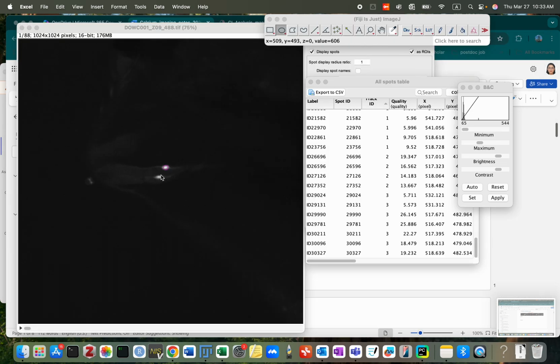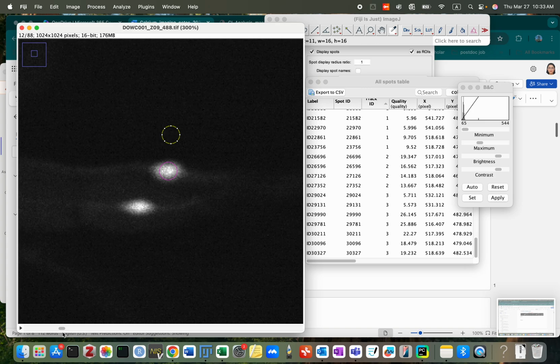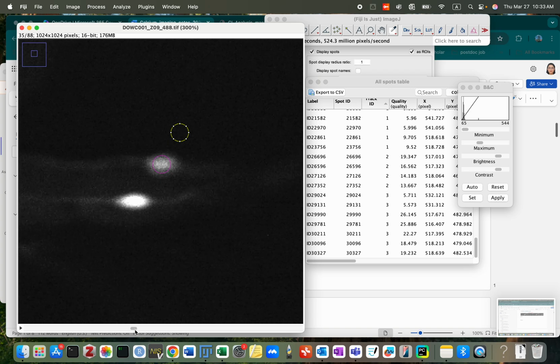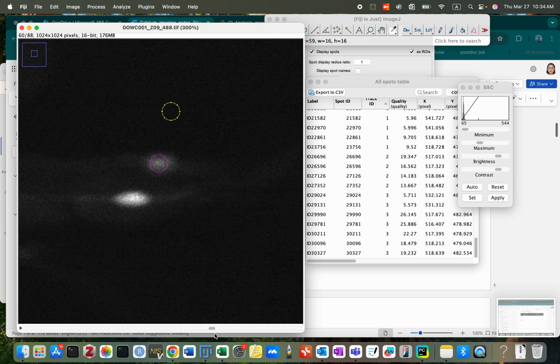Good. And background. Okay. Circle toolbar. Hold Shift. Draw a circle. This time is 16. Come to time points 12, 24, 36, 48, 60. Okay.